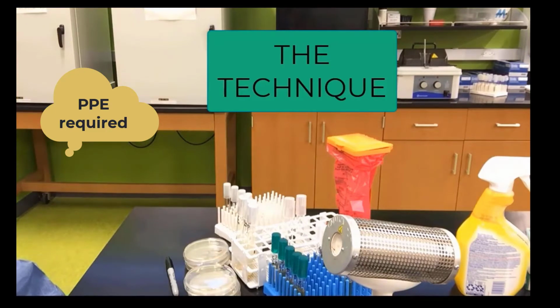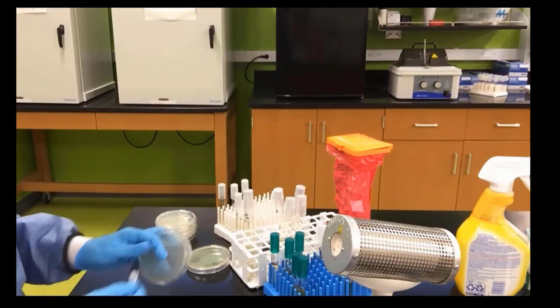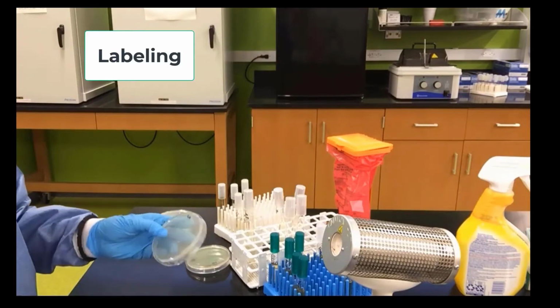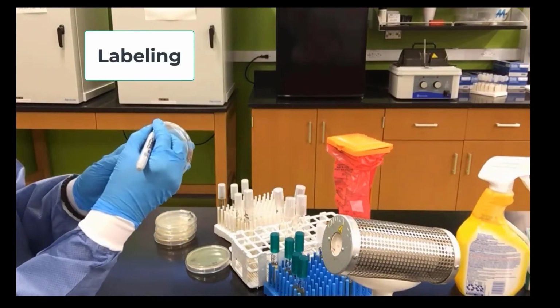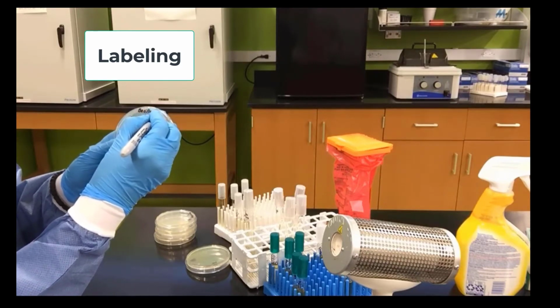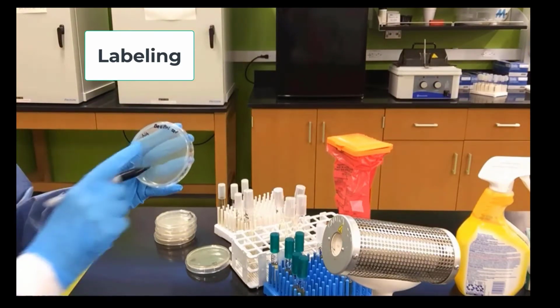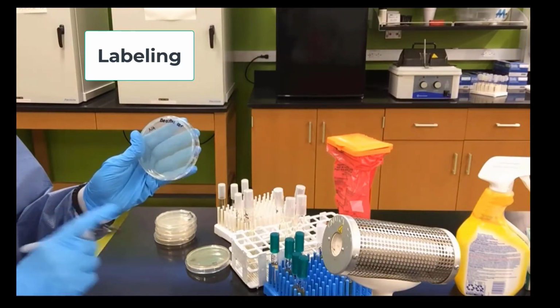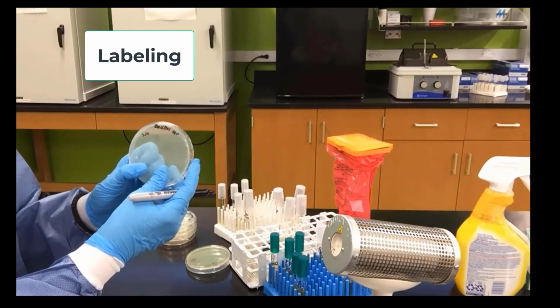Moving on to the technique, don't forget our PPE: gloves, goggles, and lab coat. We will be doing labeling. So we will be picking up our Sharpie and labeling a plate here with one of the bacterial names, Bacillus cereus. I don't want to be in the middle when I label because that will interfere with reading my results.